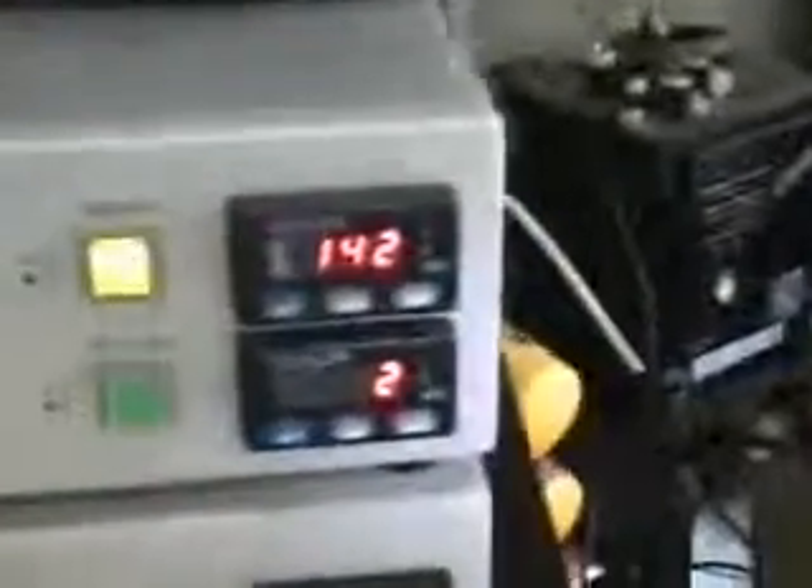I can tell you the heater does heat to 160, like the manual specified, but that's about it. The neutralizer is supposed to work, and the cooler also works like it's supposed to.